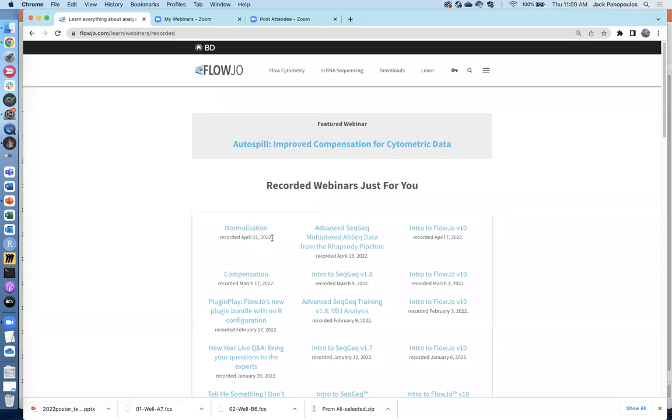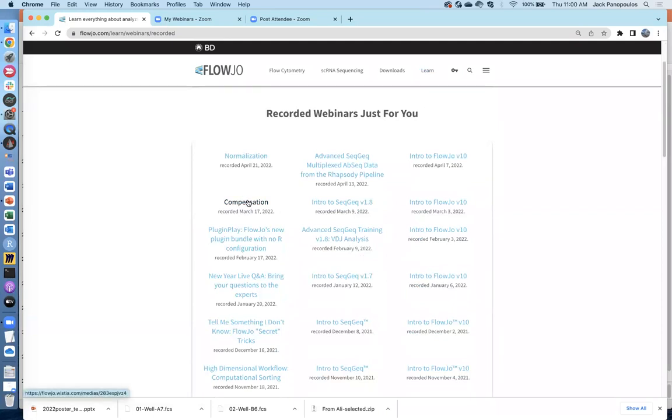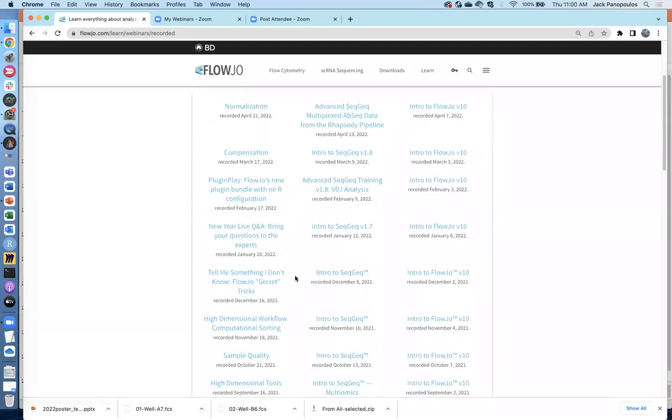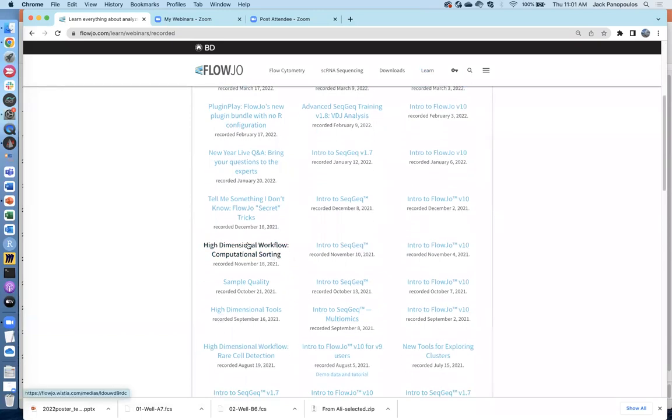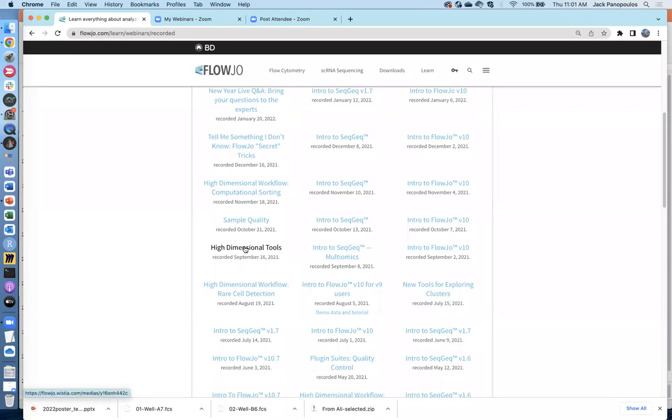So yeah, I thought I gave the normalization talk last month. So in any case, there's the normalization one. There's a compensation webinar here that was done in March. If you want to do the high dimension workflow in FlowJo itself, that's here. And high dimensional tools, this is another one that's going to walk you through the actual clicks in FlowJo proper. So that's where you find recorded webinars.